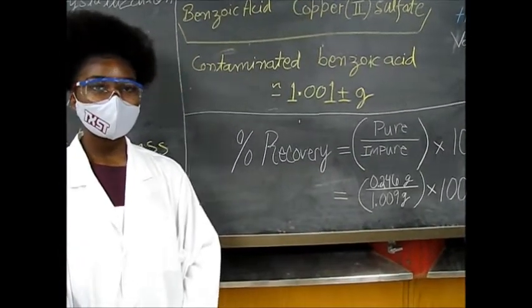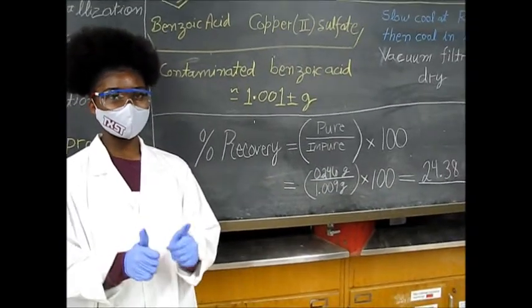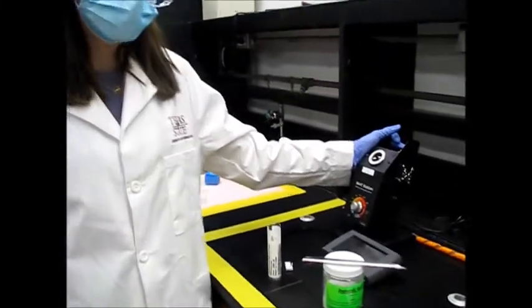Or it may have too much impurity. Or it might have had too much impurity. So now we're going to illustrate how to find the melting range when using a melt station.